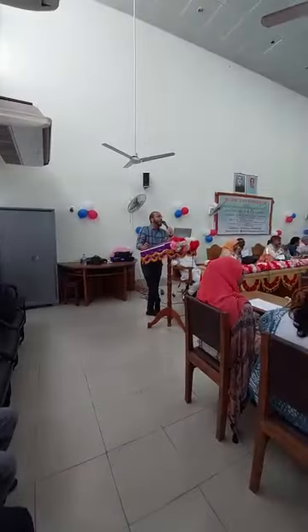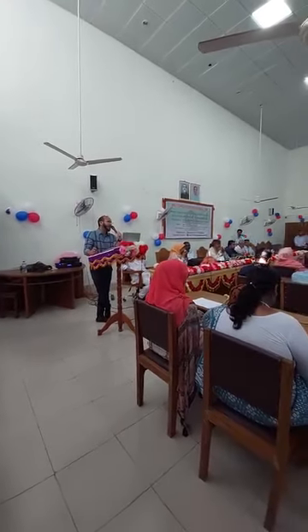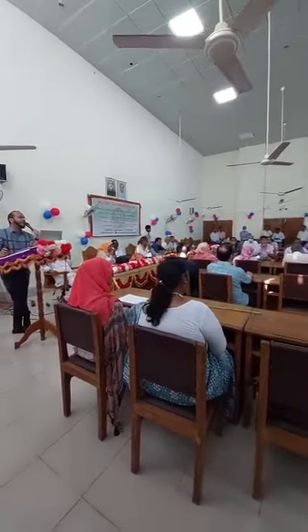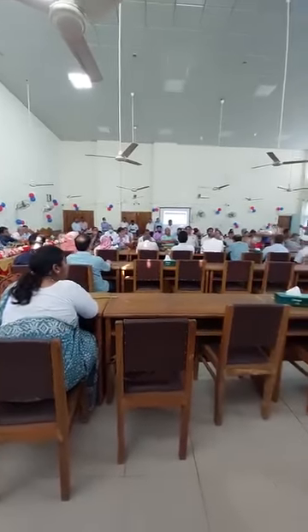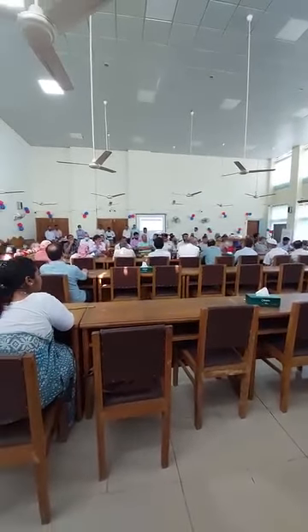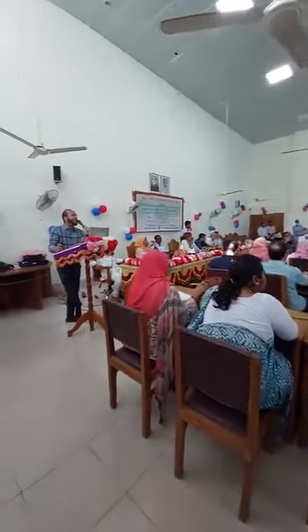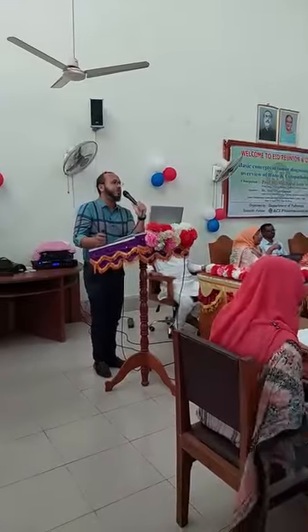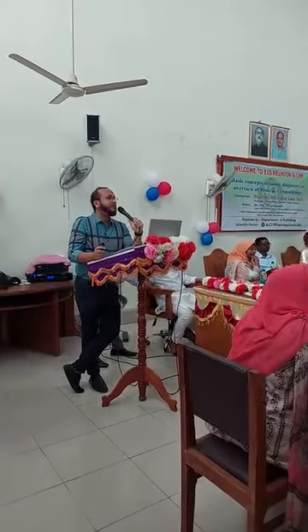First of all, I will discuss the types of biopsy in histopathology. Next, I will tell a few points about frozen sections. Then I will thoroughly discuss cytopathology, the different types of cytological techniques, and the samples we receive in the laboratory. Further, I will compare and contrast FNAC and biopsy samples. And last of all, a few take-home messages.